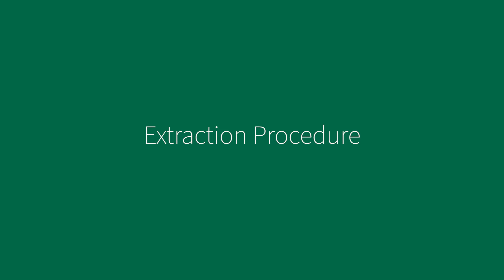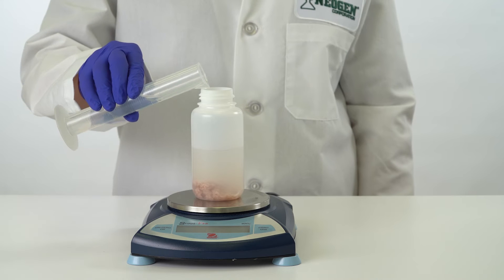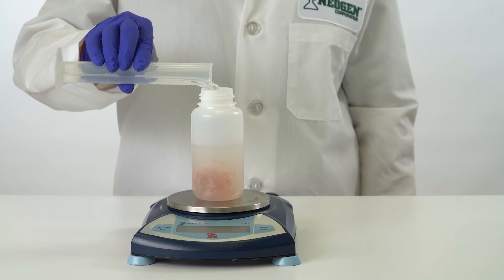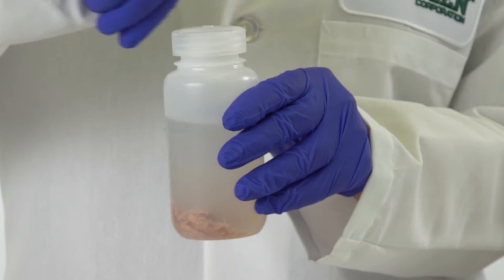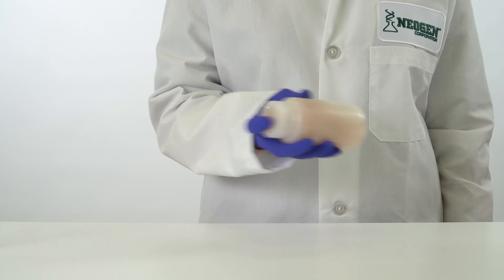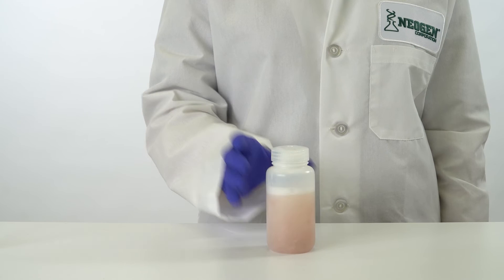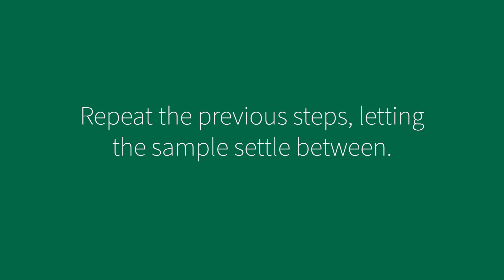For the extraction procedure, add 10 grams of the homogeneous sample to a clean disposable extraction bottle. Add 190 milliliters of deionized water to the extraction bottle. Tightly cap and vigorously shake the bottle for 15 to 20 seconds to suspend the sample in the water. Wait approximately 5 minutes and then shake the bottle for 15 to 20 seconds to resuspend the sample. Wait an additional 5 minutes and again shake the bottle for 15 to 20 seconds to resuspend the sample. Allow the tissue to settle to the bottom of the bottle for about 30 seconds. The sample is now ready for testing.